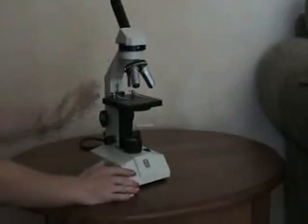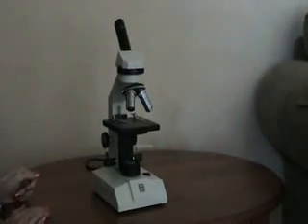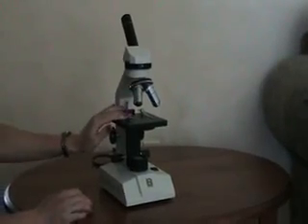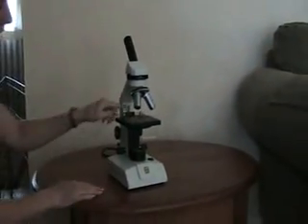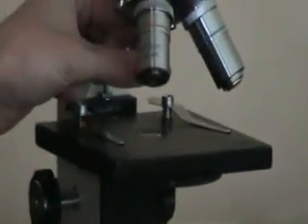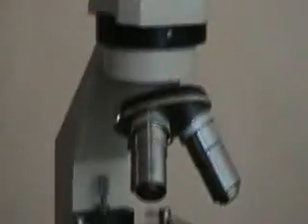Now, to use a microscope — first step, make sure that your stage is all the way lowered. Put your slide onto the stage, clip it down, and make sure your lowest power objective is on it. Put your eye through here and take a look. You can adjust your light source using the diaphragm.